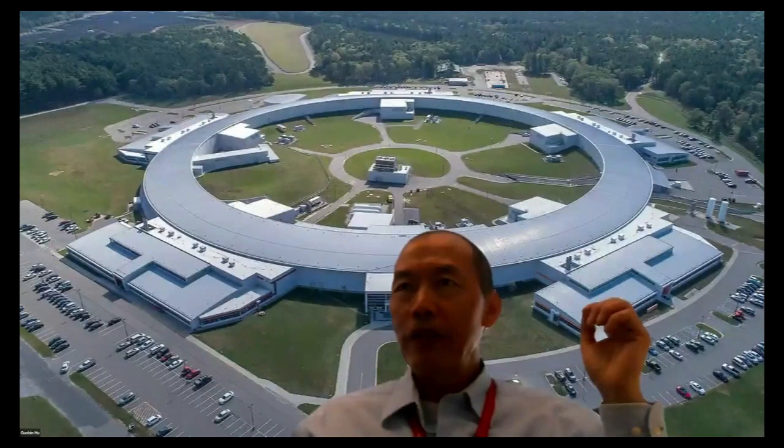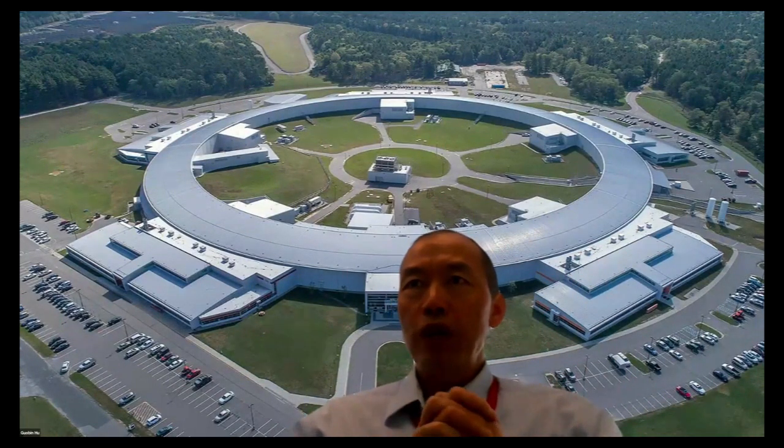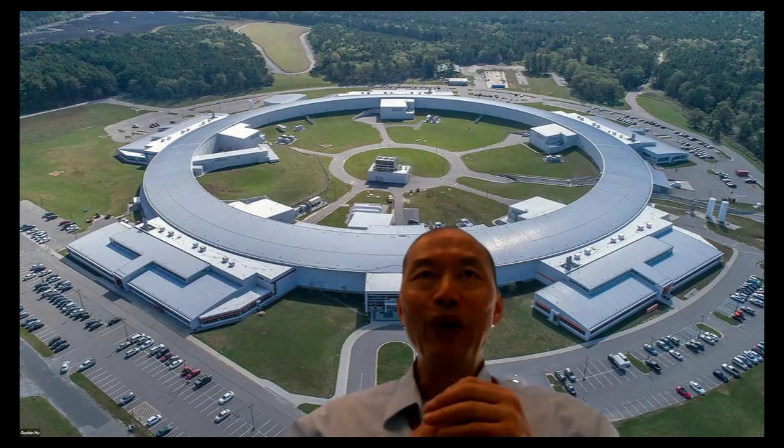Hi, Yong. It was not clear to me why our user had difficulty getting a higher resolution, but with your specimen you are able to get a better resolution. I think the power of this method is really at the front end, in particle picking and alignment.